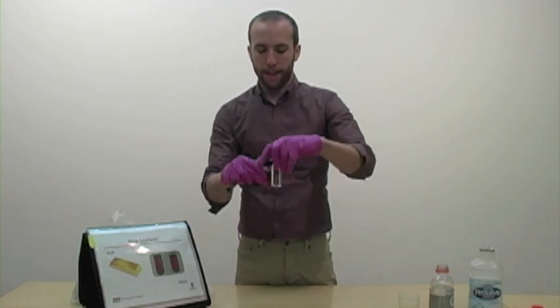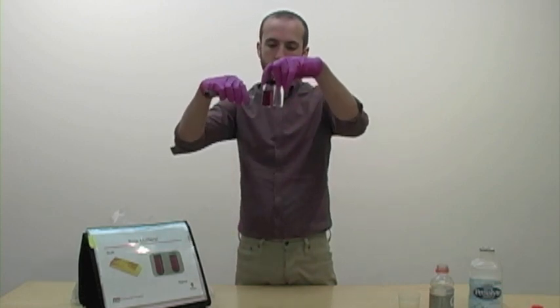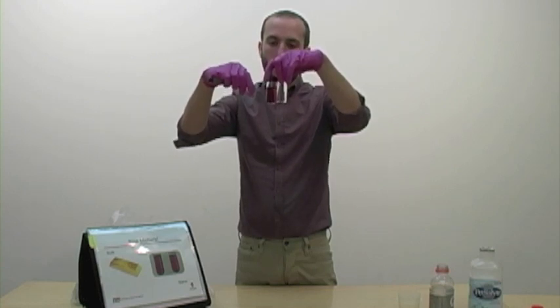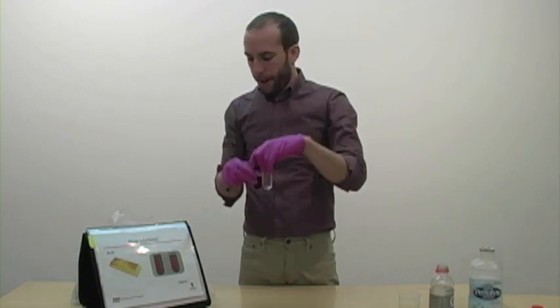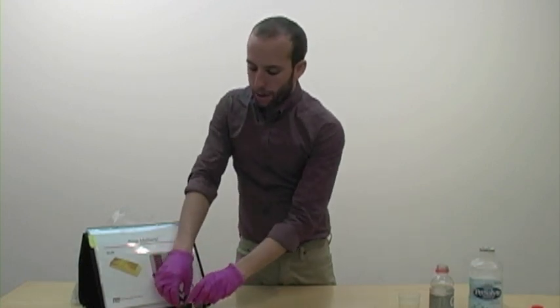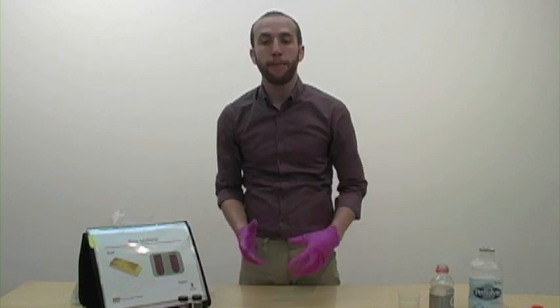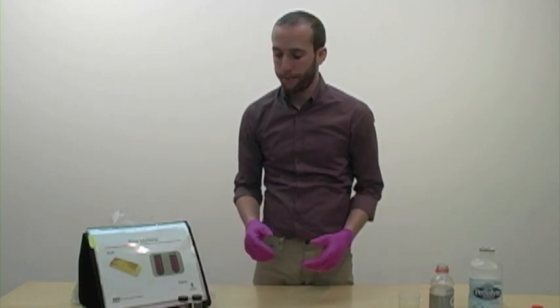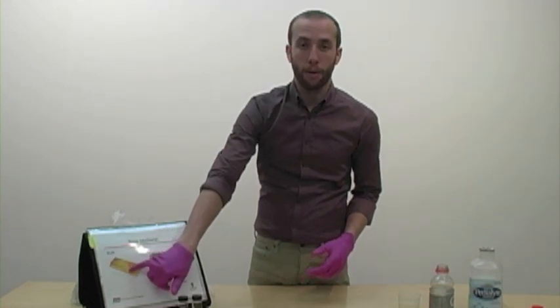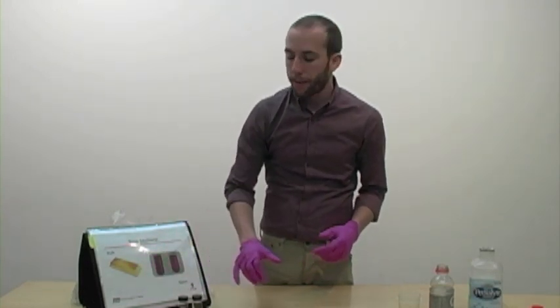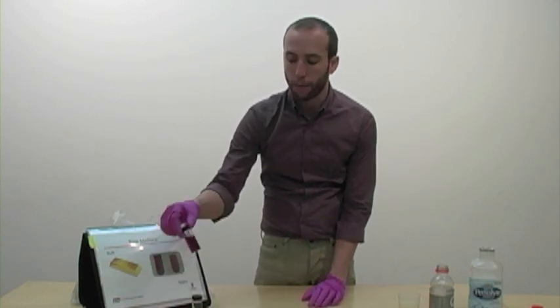But if I hold them side by side, you can see very distinctly that there are gold nanoparticles in one vial, the red vial, and no nanoparticles in the water. Now, the reason that gold becomes red at a nanoscale, or when it's a nanoparticle, is because it's reflecting a different light wave altogether. So bulk or macro gold is gold colored, and nano gold is red. That's just one of the many properties that are different at the nanoscale when we talk about gold.